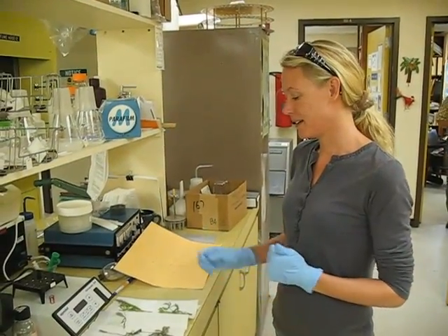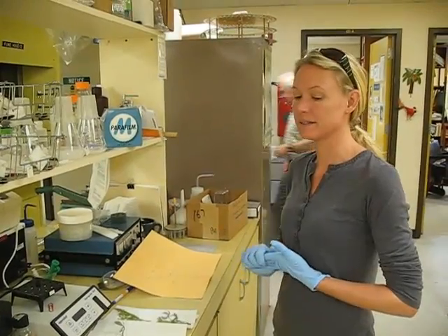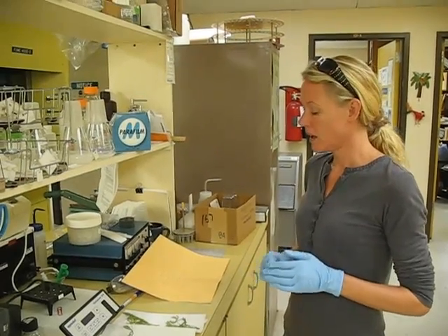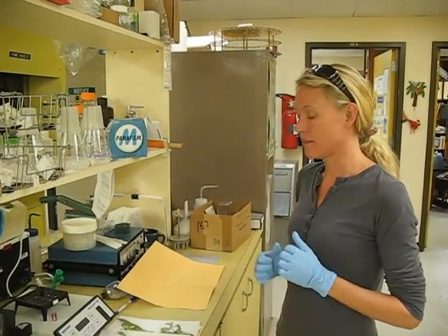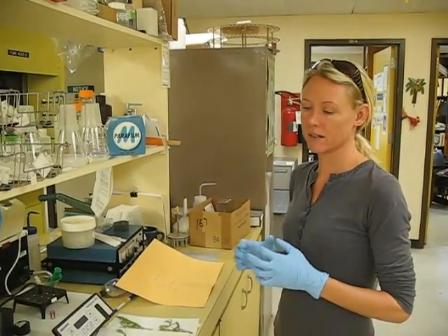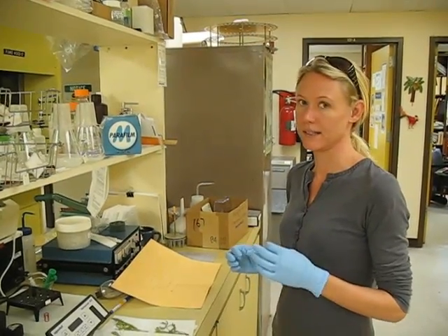I'm going to take the samples, weigh them out — hopefully around 3 grams apiece — and then I will macerate them, cut them up and macerate them with sea sand, sterilized sea sand, with a little bit of CTAB.